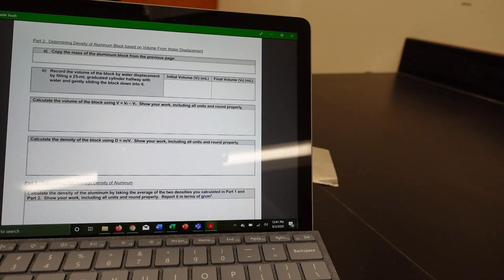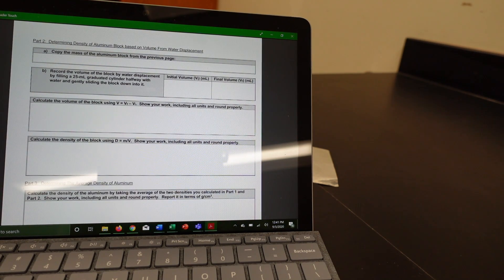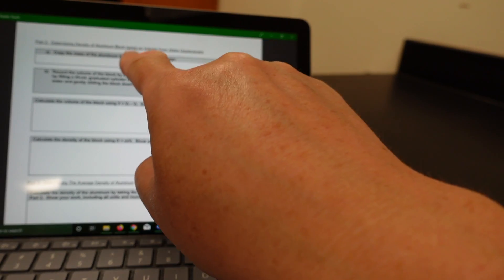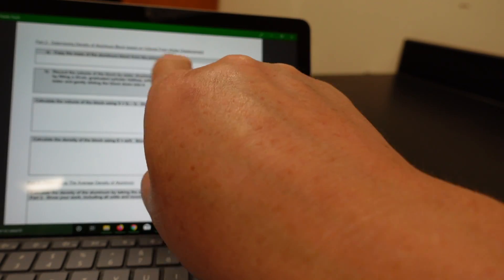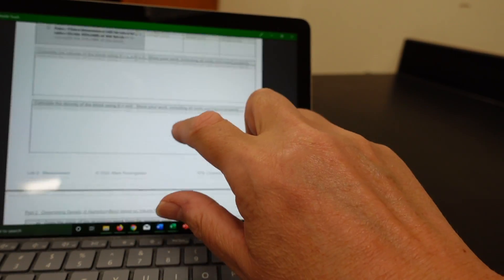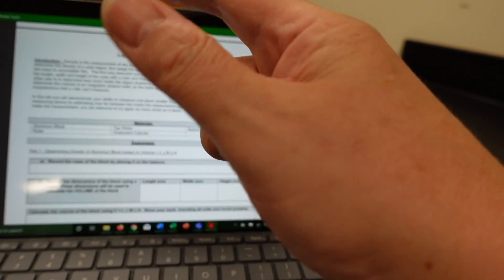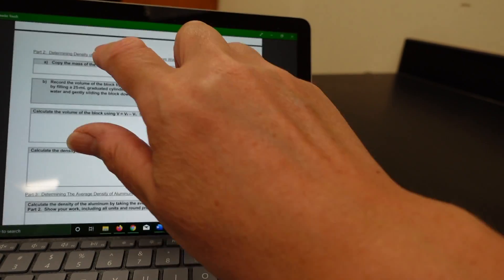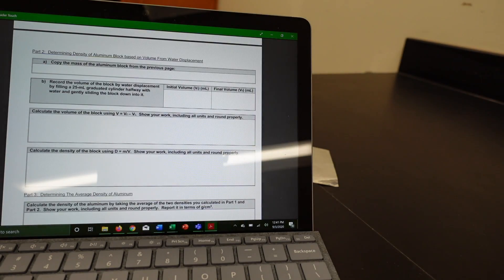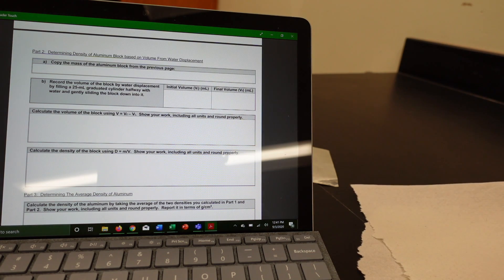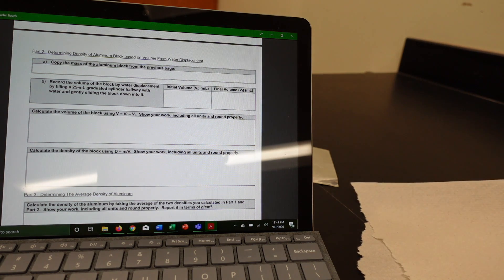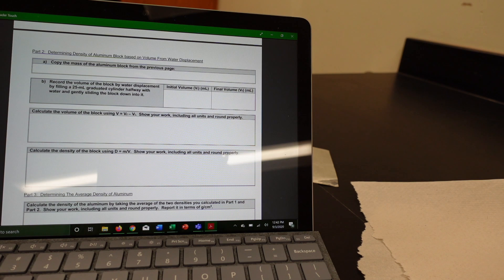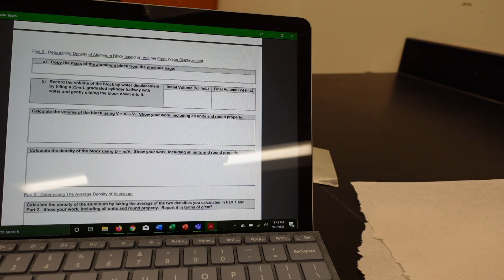Now, we're going to determine the density of aluminum based on water displacement. You can just copy the mass of aluminum you had from your previous page because that mass won't have changed. It's still going to weigh the same as it did before. So, just copy that value down. Now, let's see. Record the volume of the block by filling a 25 ml graduated cylinder halfway with water and gently sliding the block down into it.